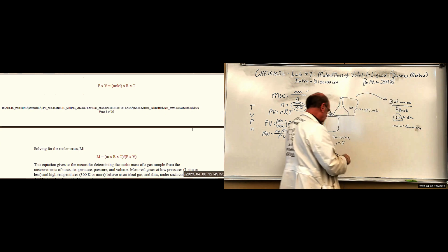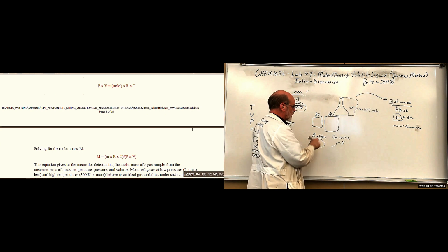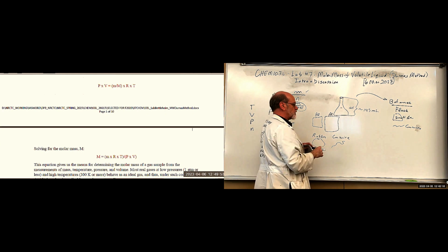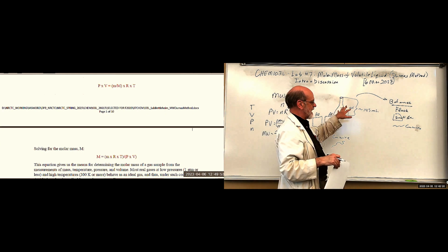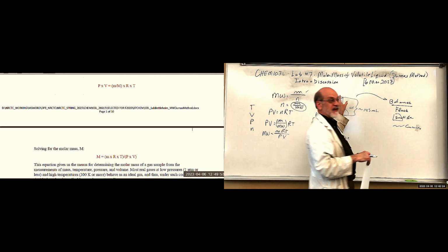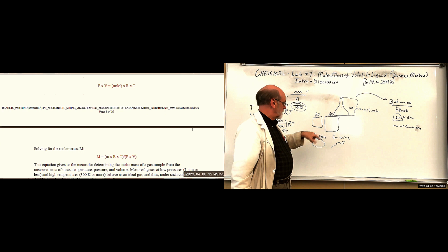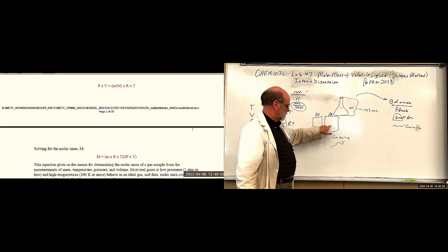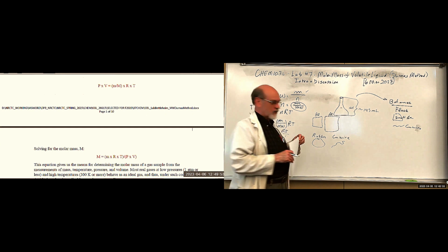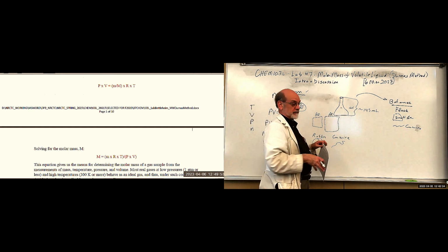Okay, you need those. You don't need the big sheet or the rubber band, because when you weigh this the second time, only these items are going to be on the flask. These will be removed. Okay, you're probably wondering, if you haven't read the method, why do you need 2 sheets of aluminum?